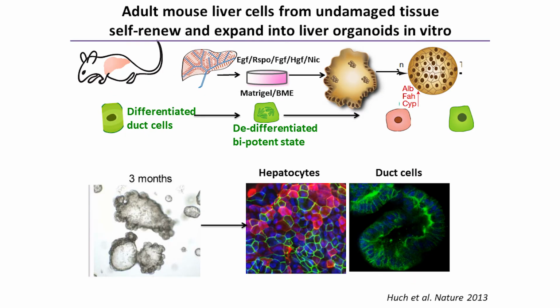Starting with the adult organoids first, this protocol we established in 2013 when I was, as I said, still a postdoc in Hans' lab. What we knew at that moment is that we can take a healthy liver tissue and dissociate it. We didn't exactly know which was the cell of origin at that moment, which came up before as a question. What is the cell of origin? In 2013, we didn't know yet. We knew it had to be something around the ductal tree, but we didn't know if it was a ductal cell, maybe a portal cell around it.